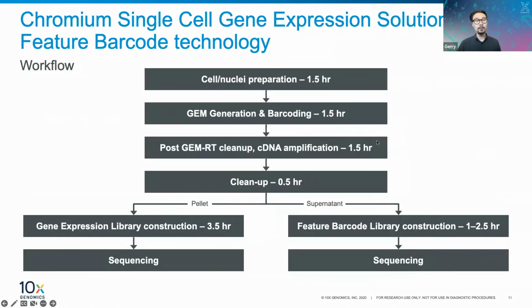Okay, so this is kind of a flow chart of the workflow. The workflow steps include cell or nuclei preparation, here with a very optimistic 1.5 hours of prep time. Obviously, this can be longer depending on your sample type. So yeah, take this with a grain of salt.